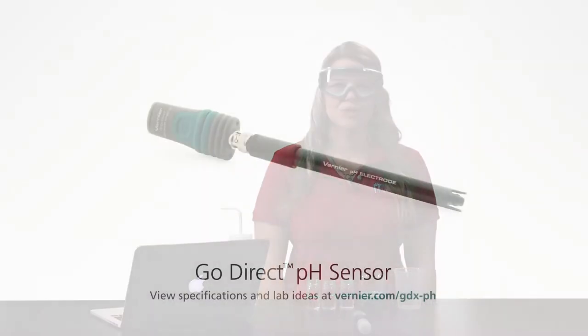In this video, we will be exploring common household acids and bases with our GoDirect pH sensor.